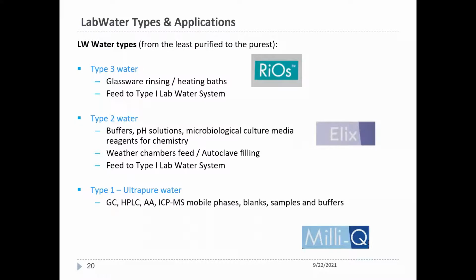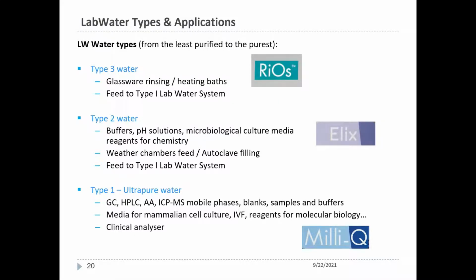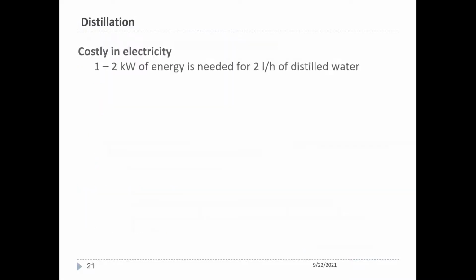Now, the ultra pure water is usually for very critical applications, so gas chromatography, high performance liquid chromatography, atomic absorption, ICP-MS, ICP, GC, GC-MS, all those. Mammalian cell culture, IVF, and then molecular biology. And also for clinical analysis in the medical institution. So when you have your sample, your test done, the best quality of water has to be used.